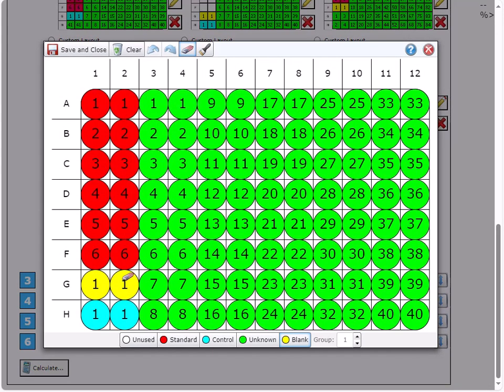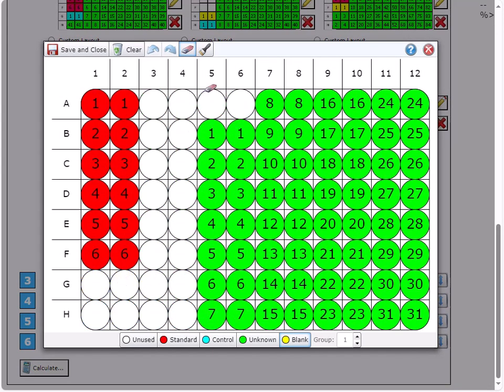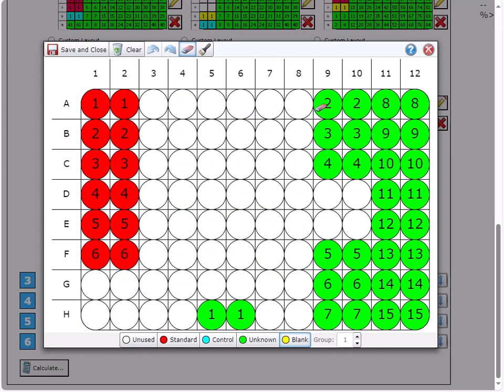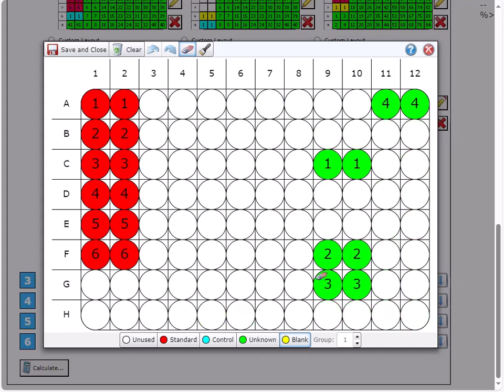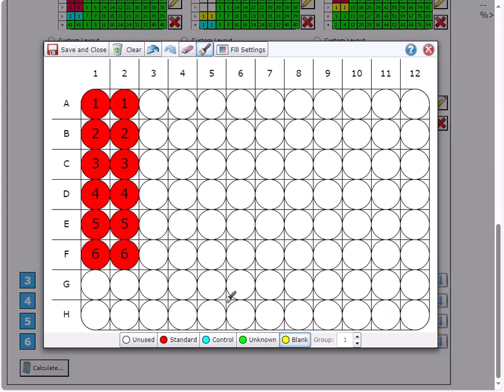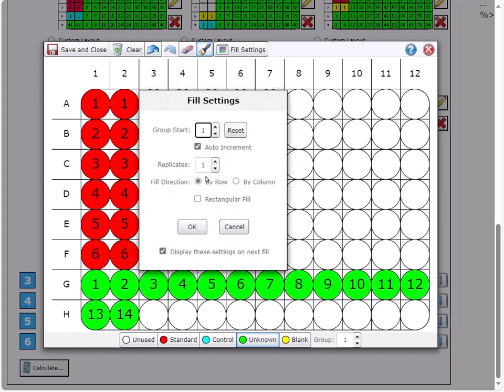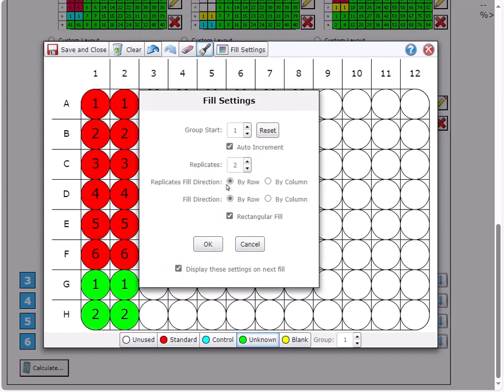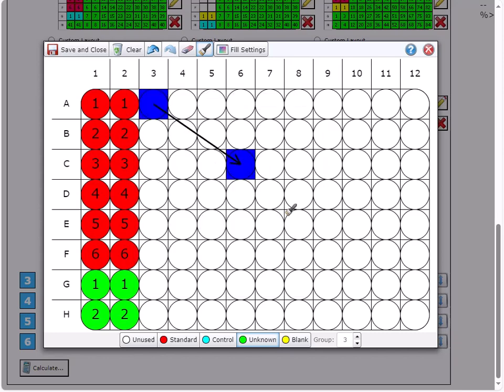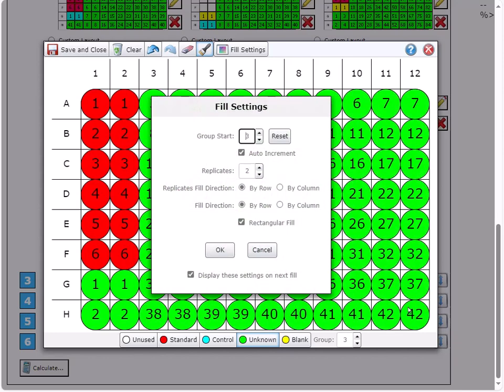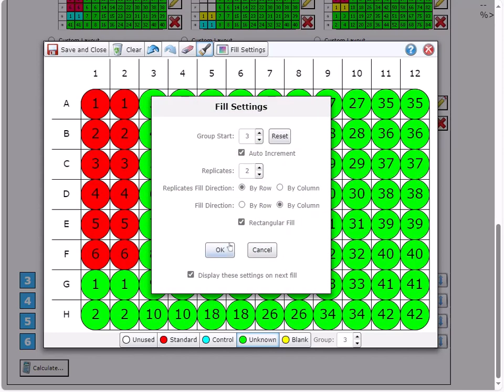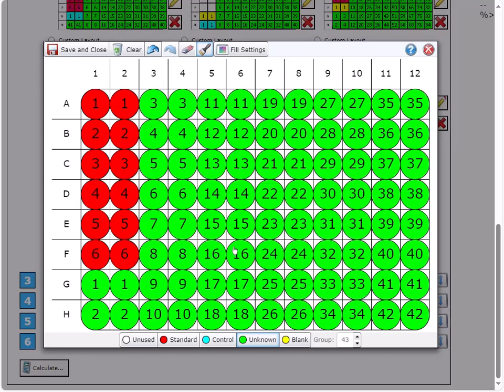I'll remove the blank and control sample and clear the unknowns from the rest of my plate. I'll enter unknown samples starting in G1 and G2 and fill the rest of the plate with horizontal duplicates. Once I'm happy with my layout, I'll save and close.